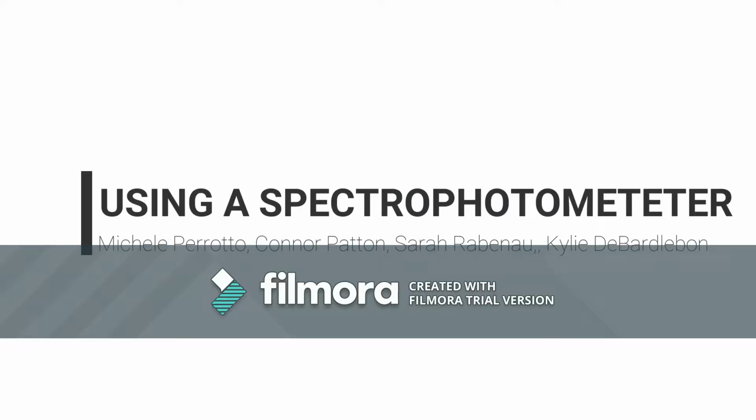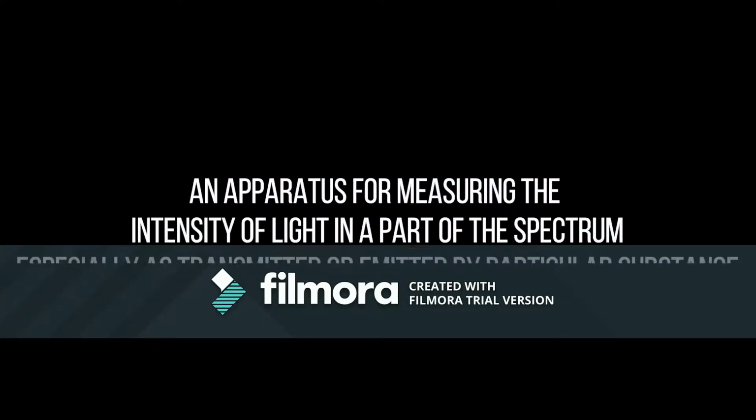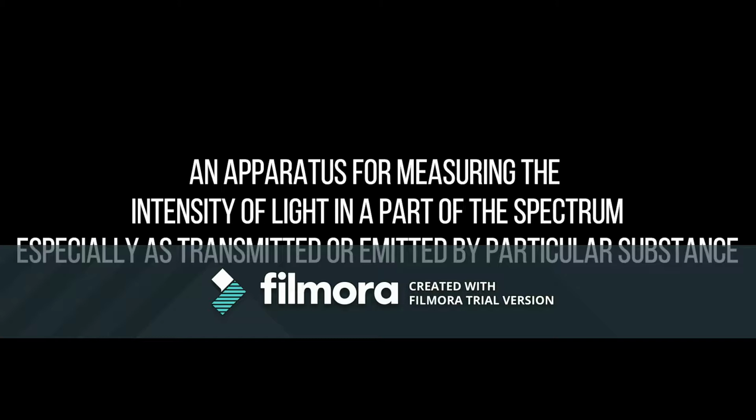Using a spectrophotometer. What is a spectrophotometer? An apparatus for measuring the intensity of light in a part of the spectrum, especially as transmitted or emitted by a particular substance.